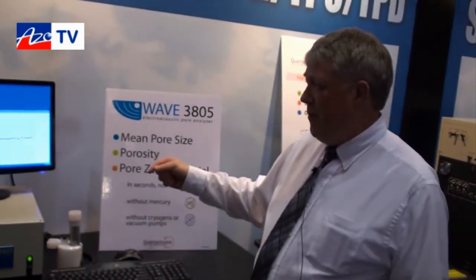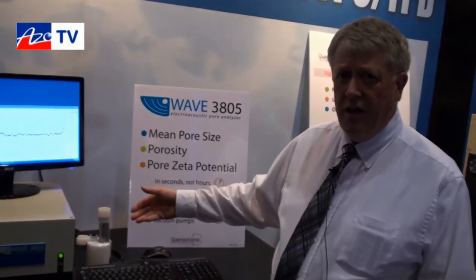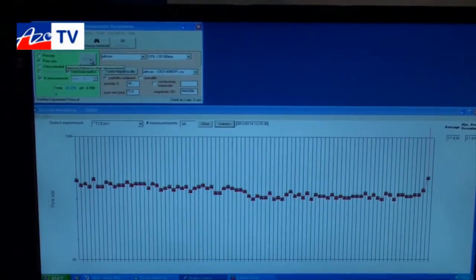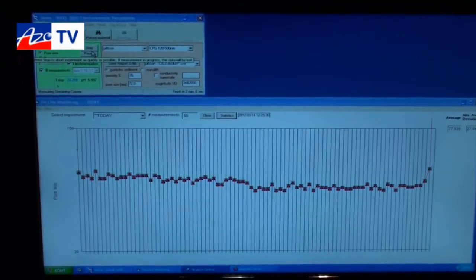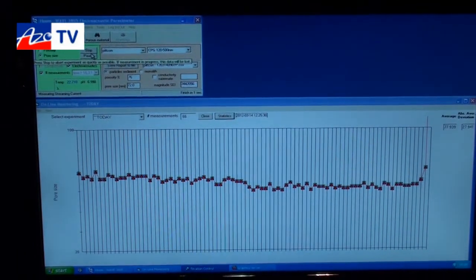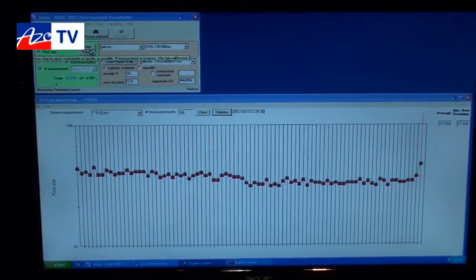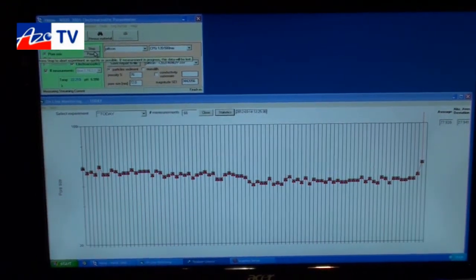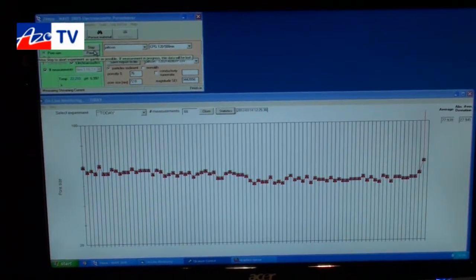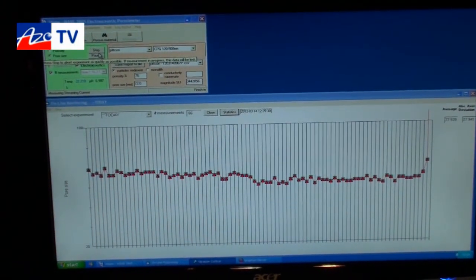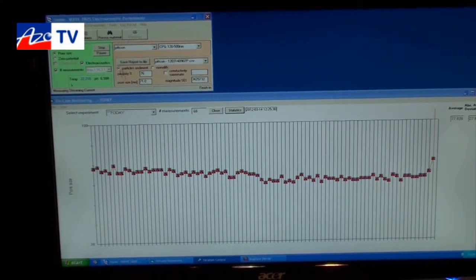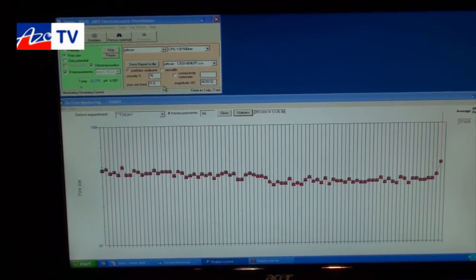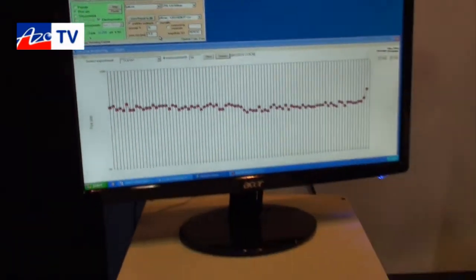This measurement can be done in a matter of seconds. Once the sample is in there, all the operator has to do is go to the software and click run. The sample is then subjected to the ultrasonic wave. Everything is being done electronically — the wave produces an electrical signal in the sample, which is read back by the sensing electronics and stored. Normally we do this a few times, but here in the software we did one run, the graph came up, and the pore size is reported in nanometers. That's all it takes — the analysis is done.